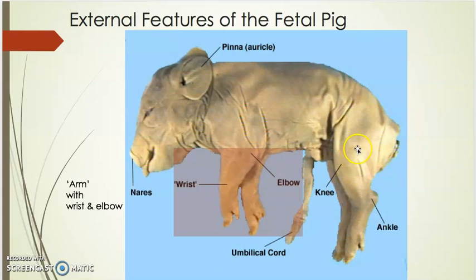If you look at the back legs, you are referencing in a proximal way this bulge as a knee, like a kneecap, and you are referencing this joint as an ankle. And it really does kind of look like an ankle. So I wanted you to know those anatomical landmarks as well, because they, again, are not brought up well.